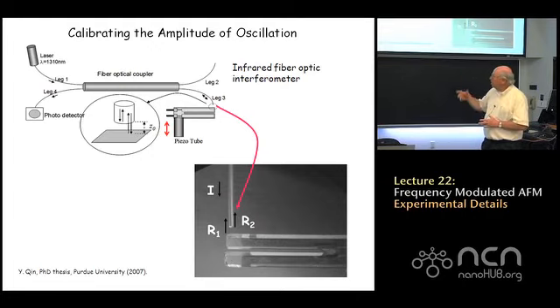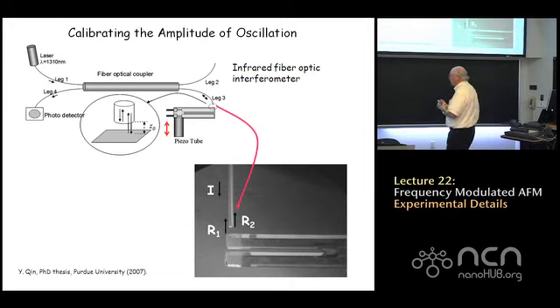And you can set up one of these interferometers to actually calibrate small changes in the position of the tine of the tuning fork with respect to the fixed position of the end of the fiber optic, right? So that's the basic idea behind it.